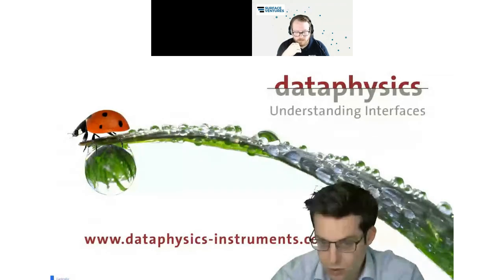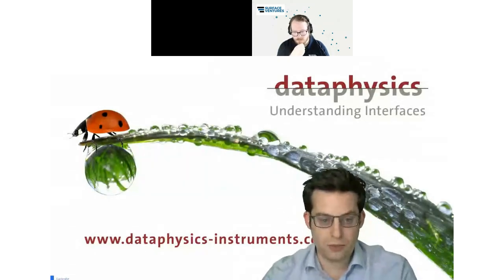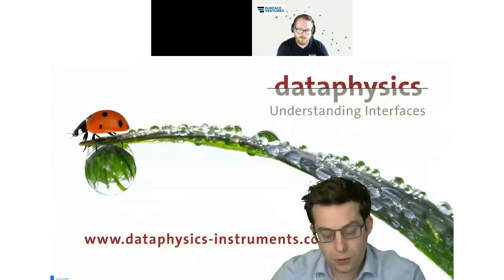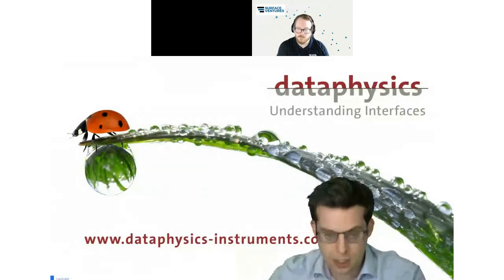But the products that we have are for analyzing macroscopic properties. So we do not have an AFM or something that can really look deeply into the details. So I would do it indirectly through the force of adhesion.